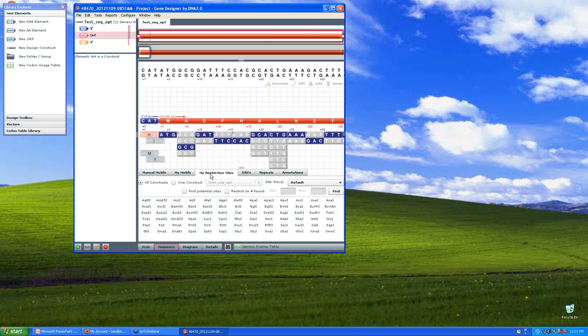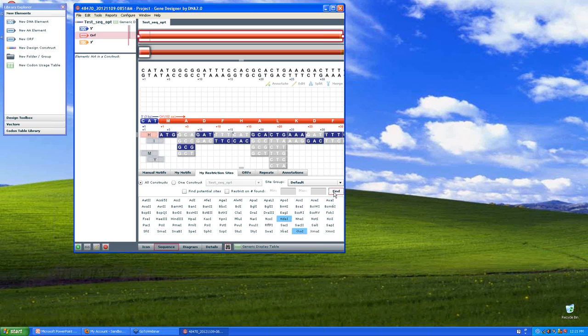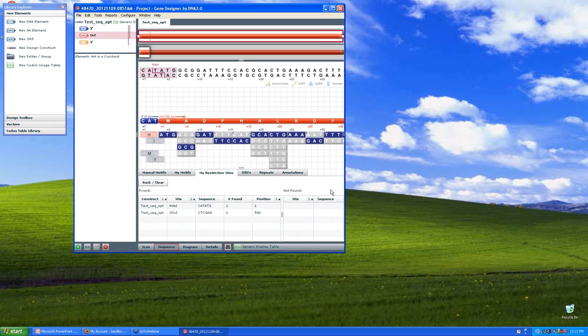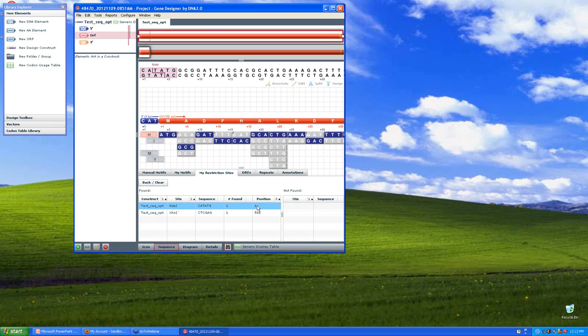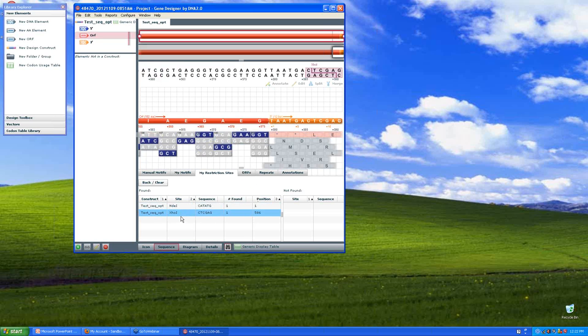Now I know that I care about XHO1 and NDE1. And what I want to find out is where they are and if they're unique. I expect these to be on the flanks of the insert. So the first site they found is NDE1. There's one position found and it's at position one. And if I highlight that, I can see here it's in pink. And again, it's unique. So that's very important and that's good. Finally, XHO1 is at the three prime end where I want it and it's unique also.